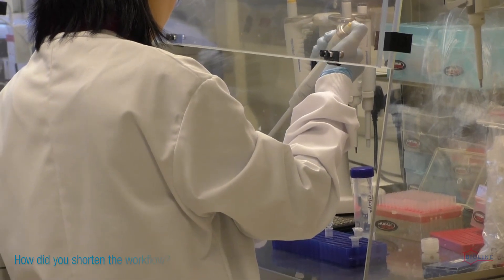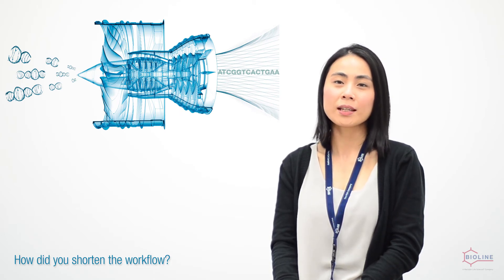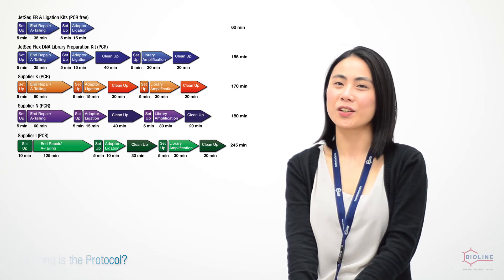Gizzer's optimized buffer and enzyme compositions allow end repair and ligation to be combined in a single tube reaction. This greatly improves the workflow and shortens the time of the whole library preparation. It takes as little as three hours to complete the library construction.